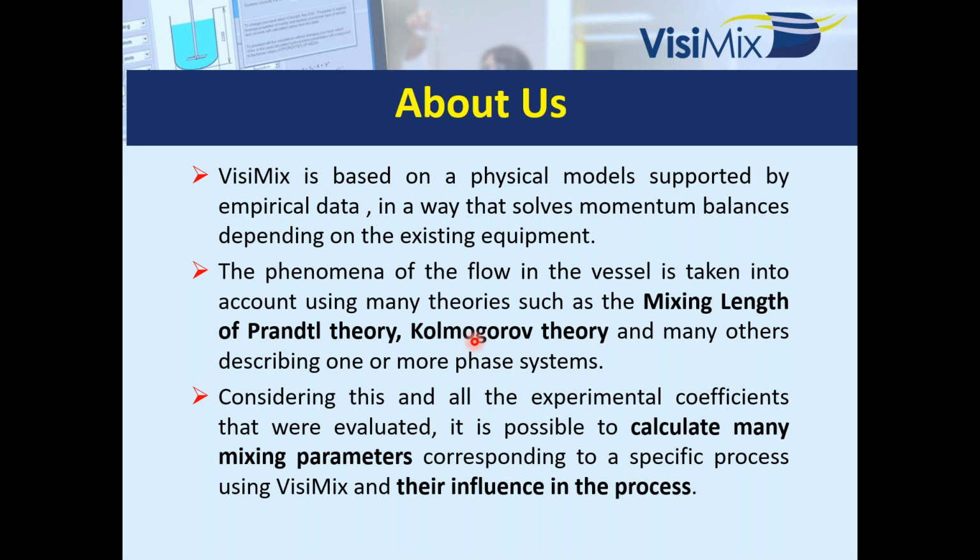It will be enough to have some starting point: the kinetic coefficient and the power that is normally representing the reaction rate. That will be required as a first starting point in order to understand this interaction between the reaction and the process.